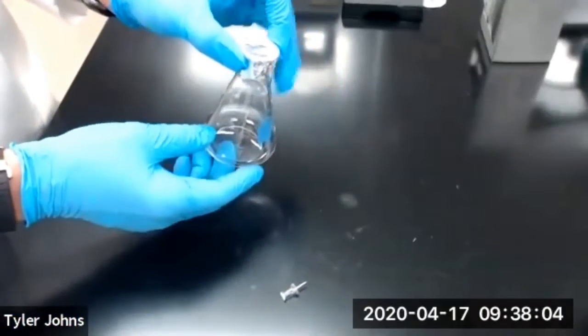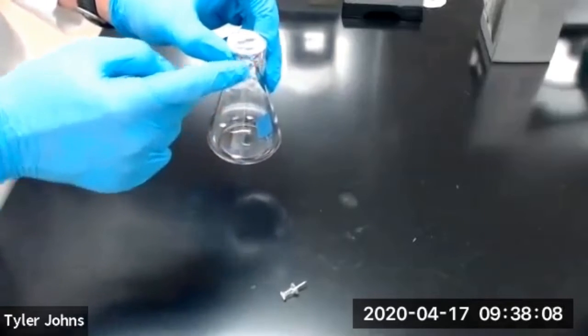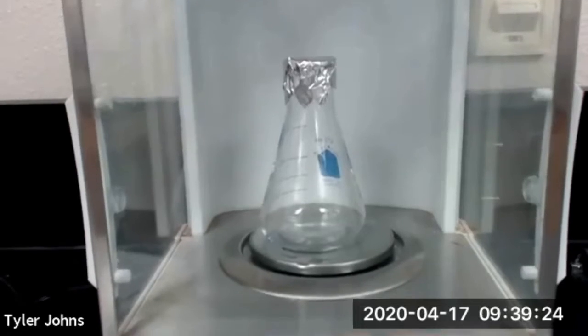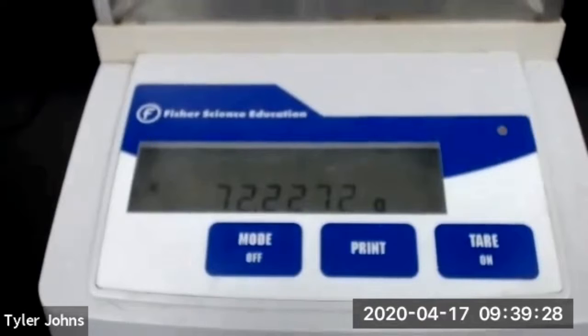Now we're going to determine the mass of our 125 mL Erlenmeyer flask and the foil lid. The mass of our 125 mL Erlenmeyer flask plus the foil lid is 72.2272 grams.